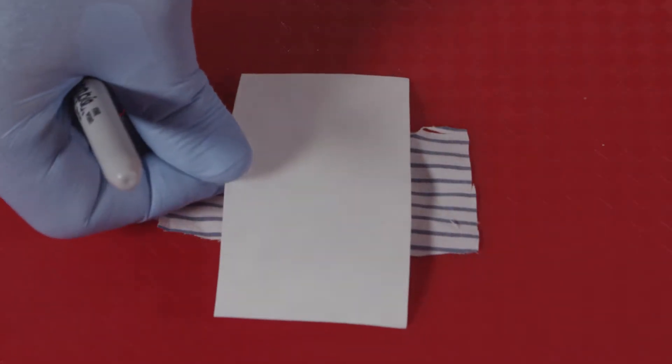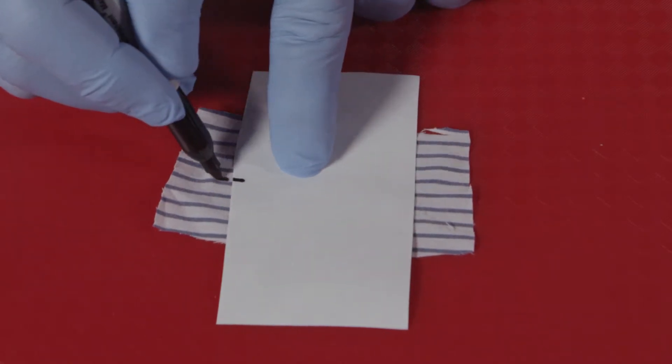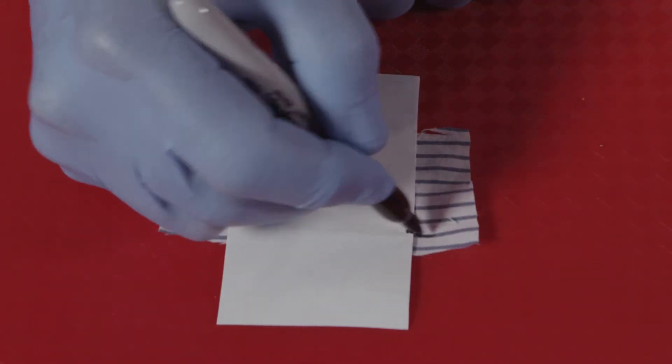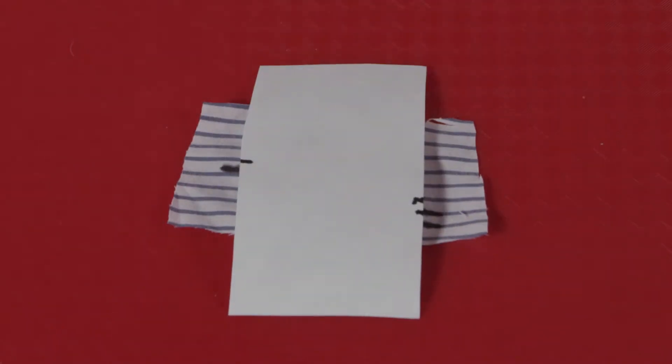It is a presumptive test for saliva that allows for mapping the stains of interest for further analysis using the Ceratec amylase card. The enzyme alpha amylase is present in very high levels in saliva and its ability to digest starch lends itself for detection very easily in dried stains.